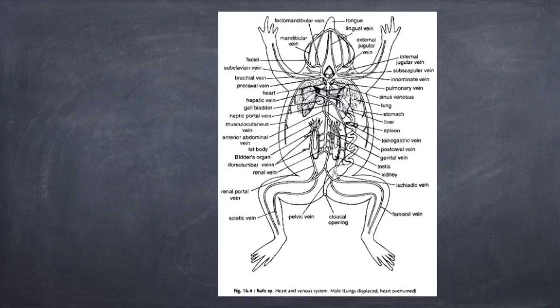Next will be the gallbladder. It is a small rounded sac. It is for storage of bile, and the location of it is in the ventral surface of the median lobe of the liver. After it will be the stomach. It is a bag-shaped, muscular, slightly curved sac. It has two regions, the cardiac region, which is the wider anterior portion which joins the esophagus with the stomach, and the pyloric region, the posterior region located near the pyloric sphincter.